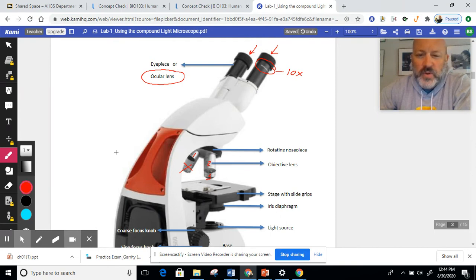But with using oil, a lot of students forget to clean it up, and it makes a mess, and then it dries. So for that reason we don't really use it in class. But we do use these three.